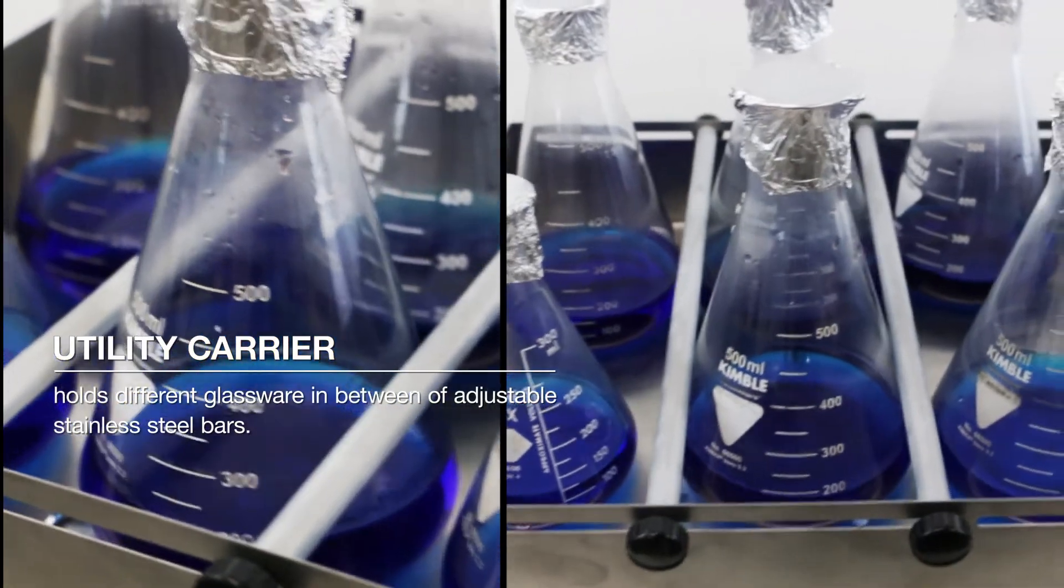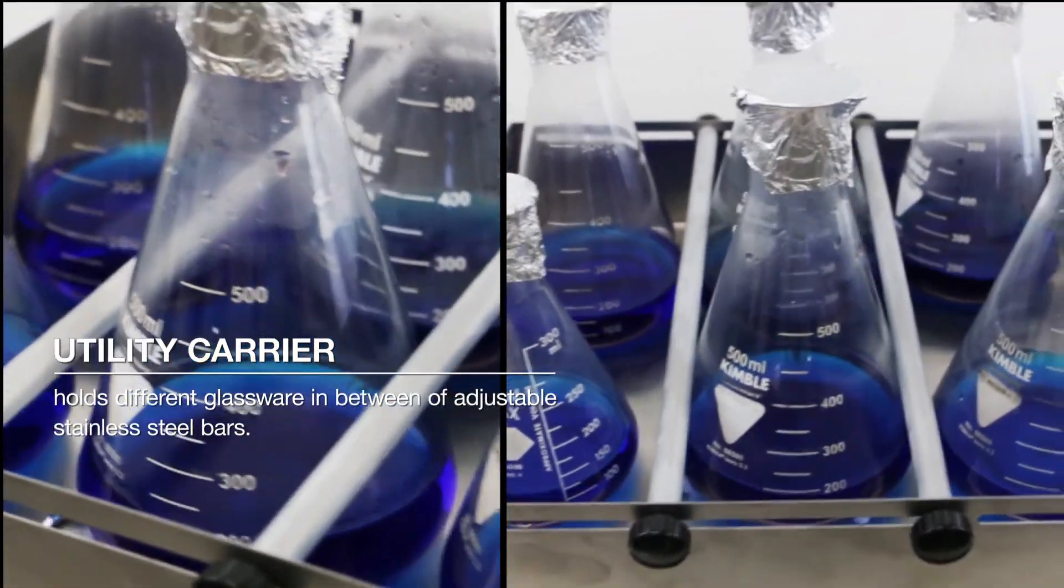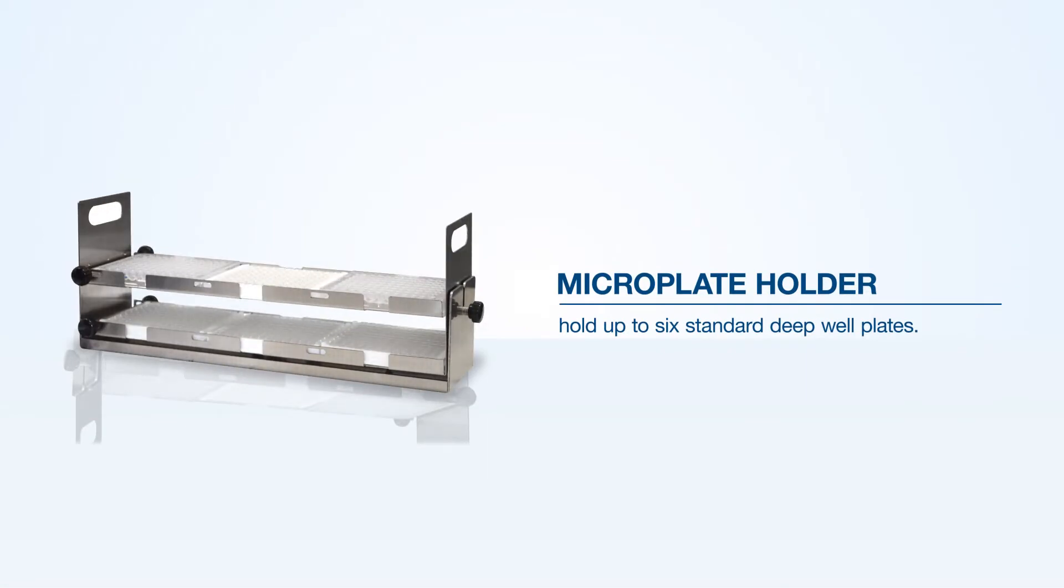Utility carrier that holds different glassware in between adjustable stainless steel bars. Micro plate holder that holds up to six standard deep well plates.